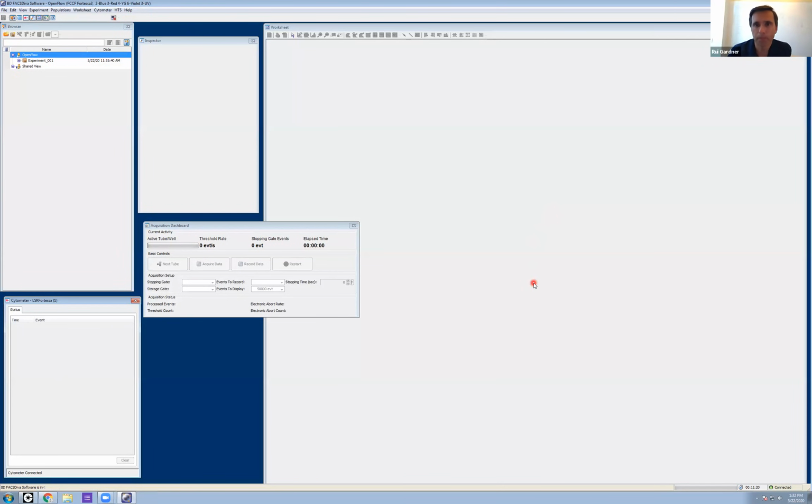Yes. Actually, there's a question here on how often the cytometer baseline measurement should be done. So the baseline, with any major intervention at the time of installation, or it typically has to be done every 6 months because it expires at the 6-month point. So typically what you'd have to do is run it in advance of that 6 months. And if you're an administrator and you're running the baseline, I would suggest making sure the performance check passes to make sure the instrument's in a good condition before you rerun baseline.